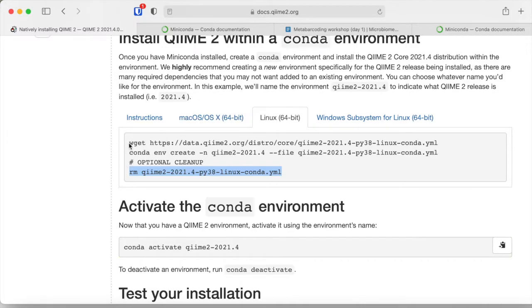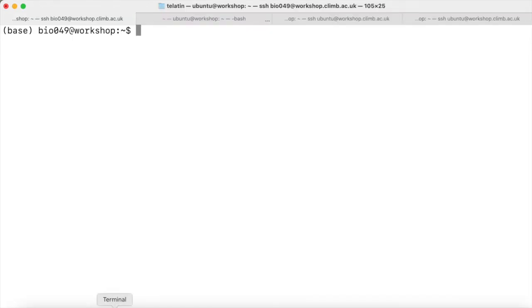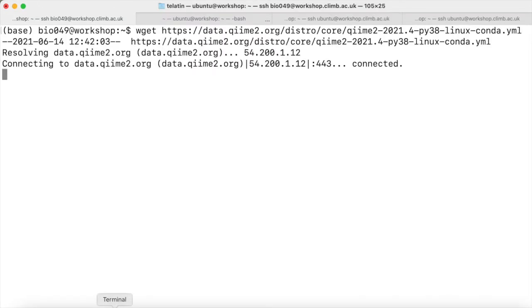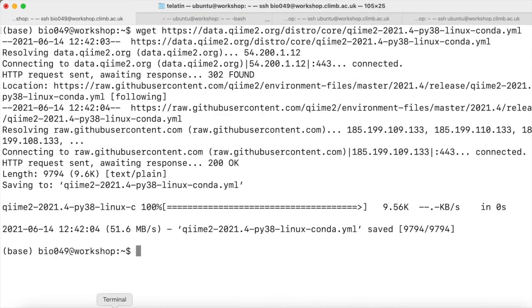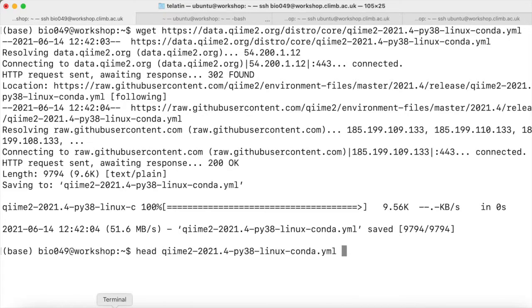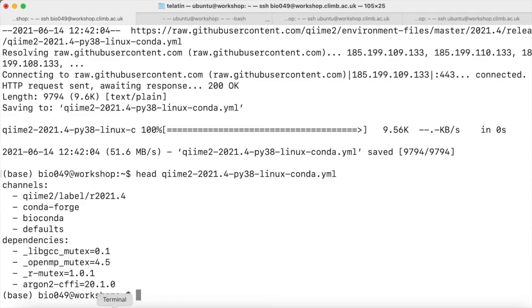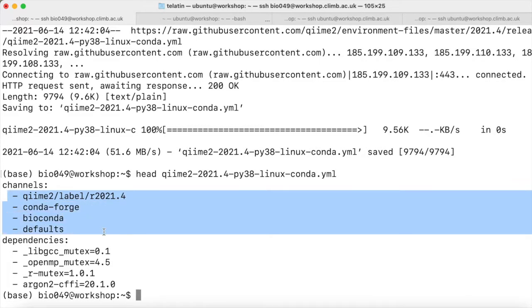Let's start by copying the wget command. Let's check that we know the correct file — it should be a text file with a list of packages. And this is it. These are the channels that will be used.